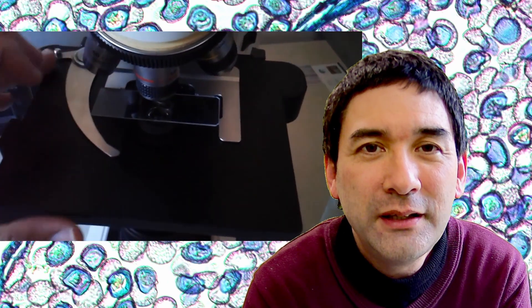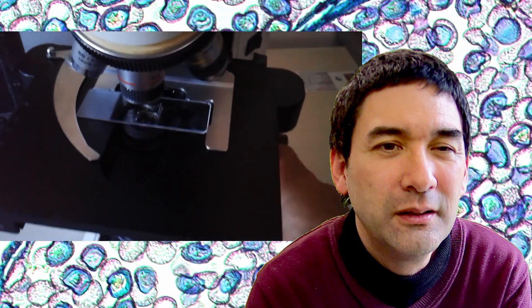I was using my mobile phone evidently, so it's kind of shaky and a bit underexposed. How does the picture look? Here it is. Yeah, a little dark, I would say. Not too many details to see here.